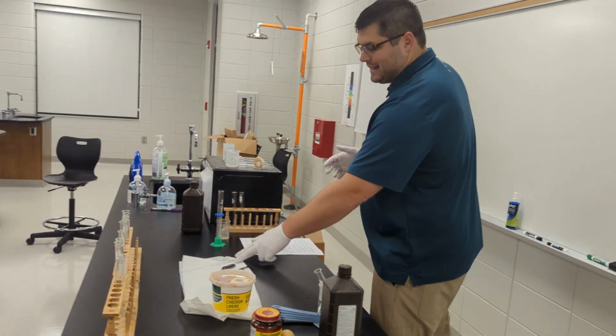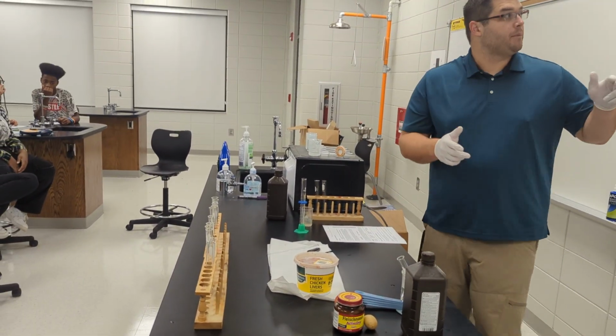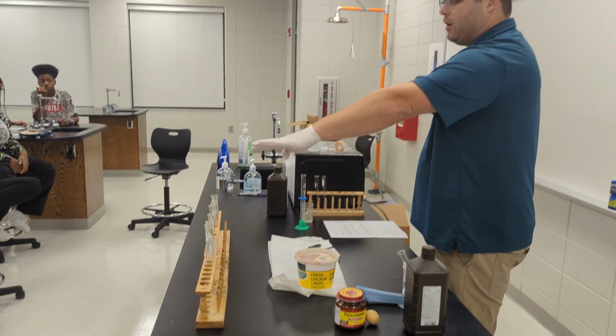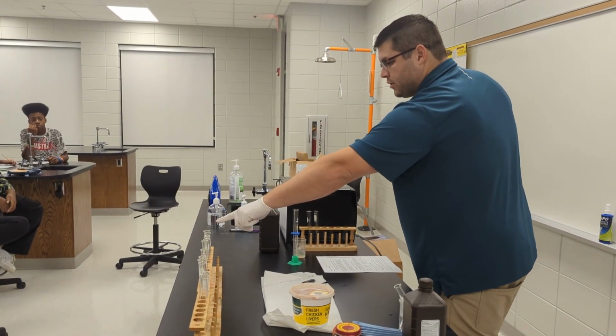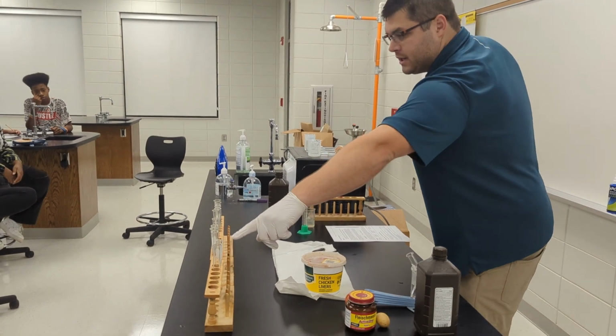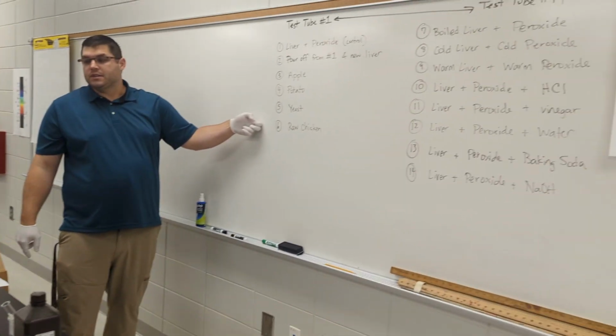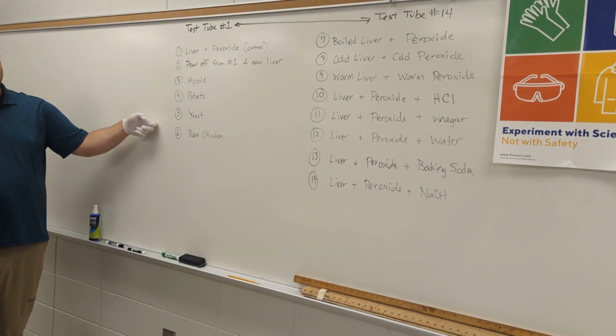Over the entire lab so that you can see it. Just a couple things I want to highlight is there's going to be 14 test tubes that's going to have all of your data. So test tube 1 is going to start over here and then go to 14. So this will be test tube 14. And then I number them up here so you can see what each one stands for.